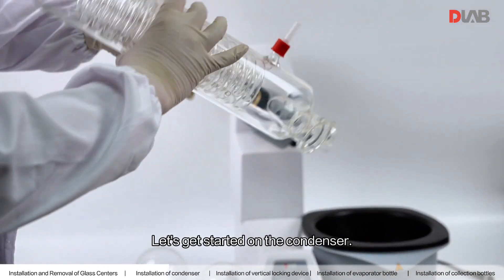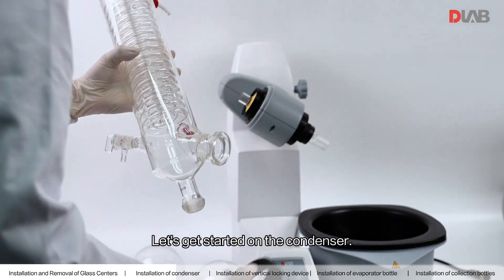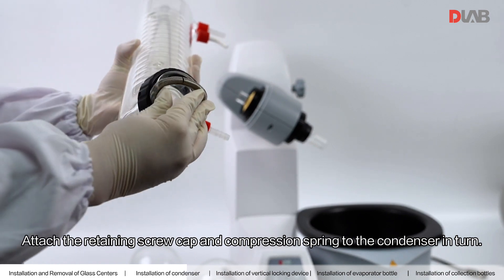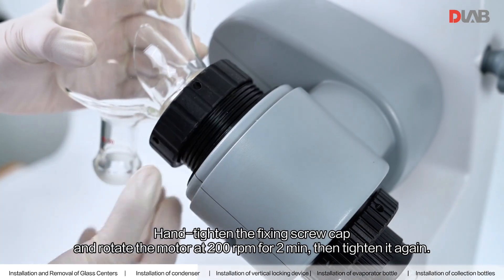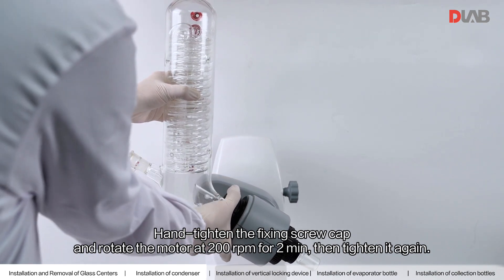Attach the retaining screw cap and compression spring to the condenser and turn. Hand tighten the fixing screw cap, then turn the motor on at 200 RPM for 2 minutes, then tighten it again.